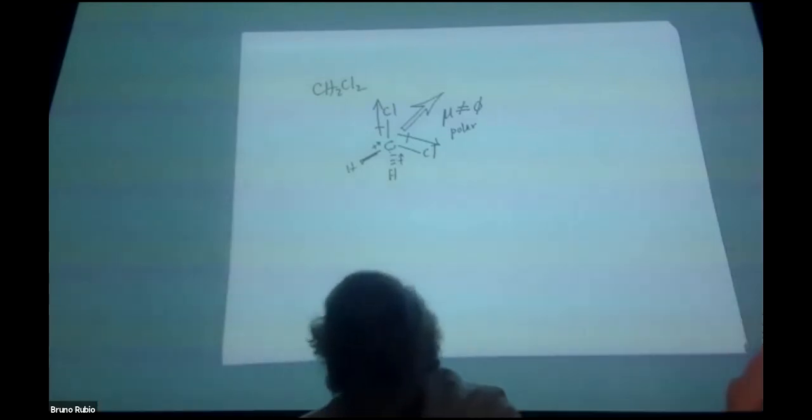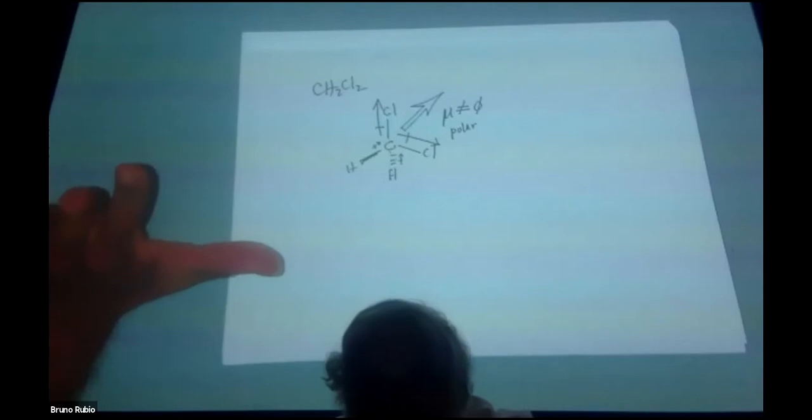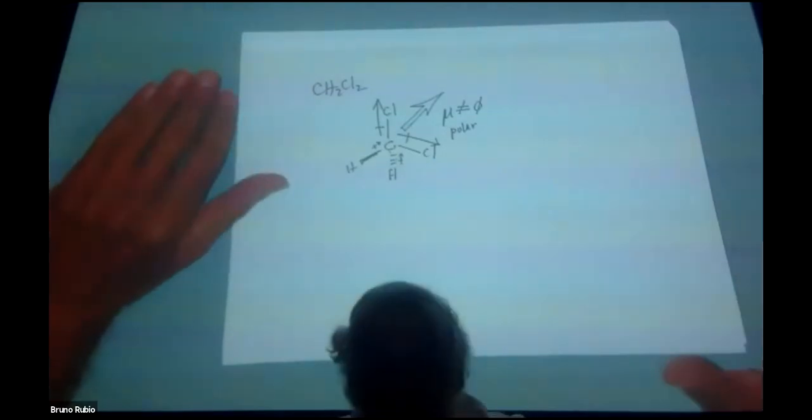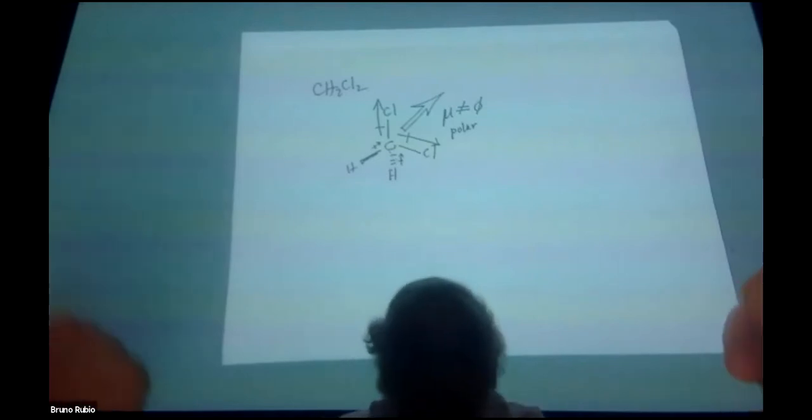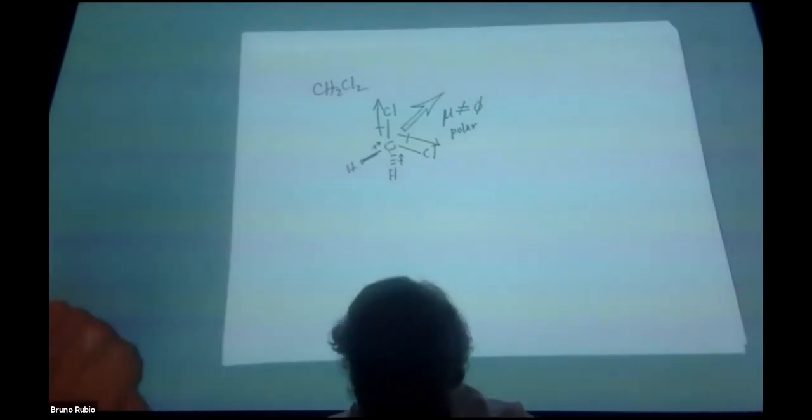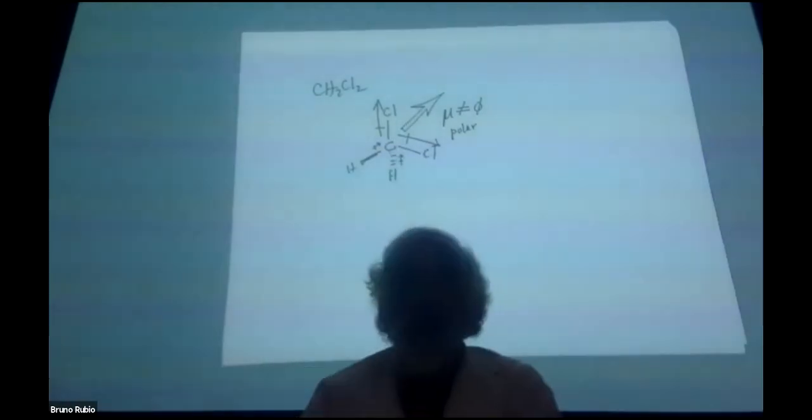And how does it compare to the polarity of the solvent that is washing over the support? If you choose the right solvent, you can get a pretty good separation. Okay, so that's all I have for you today.